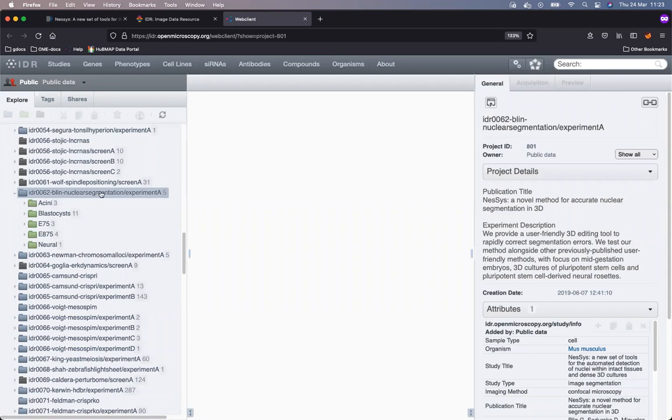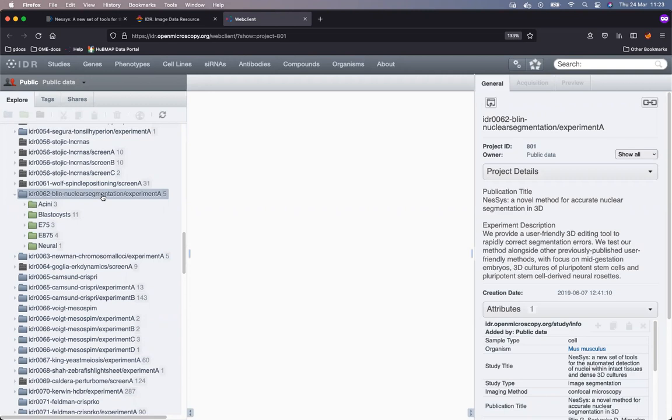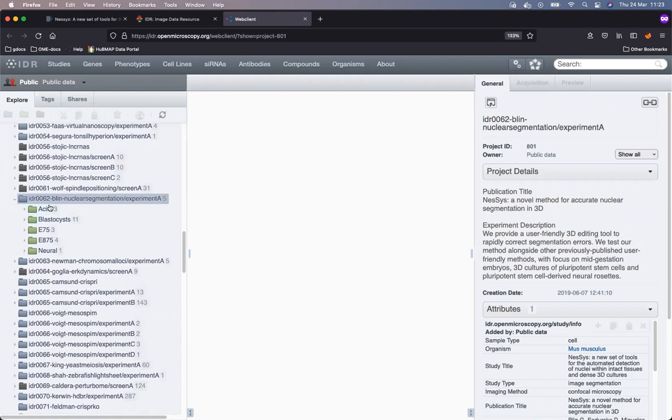On the left hand side, the top container representing a study is selected. Study is a unit of submission into IDR associated with one particular publication. Under that container, we have some subcontainers which we call datasets.